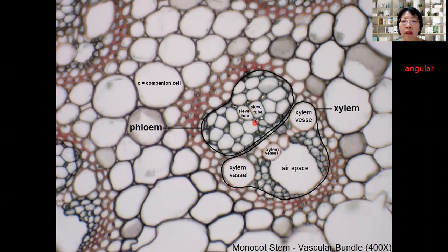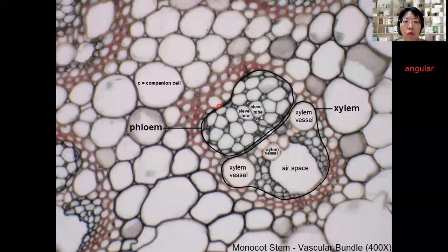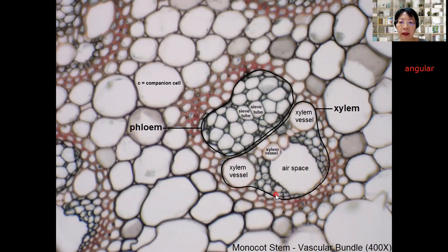The tiny cells at the side of the sieve tube element are the companion cells. Then you see this solid black line drawn surrounding the phloem — it's very easy to identify because the cells outside the phloem have lignified walls, which appear pink in color due to the stain. So it's very easy to outline the borderline of the phloem. Outside is also cells with thickened walls with lignin, pink or red in color. The borderline between the xylem and the sclerenchyma is very easy to identify and draw.